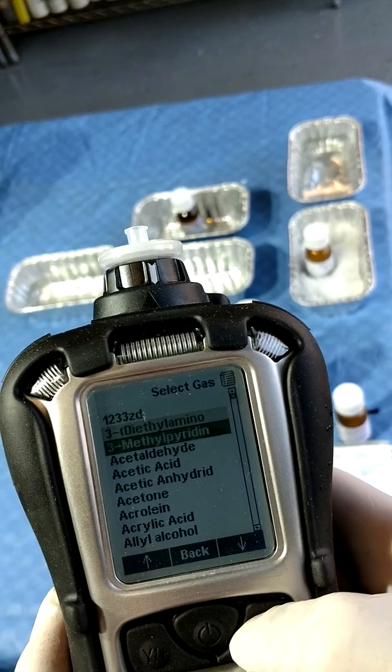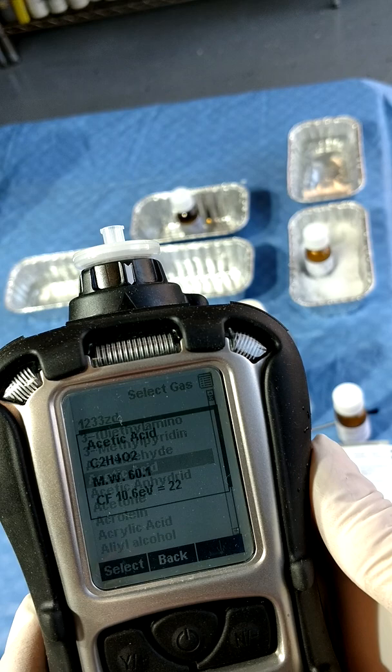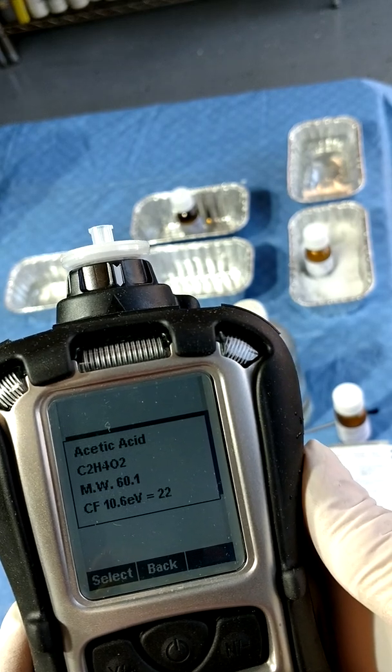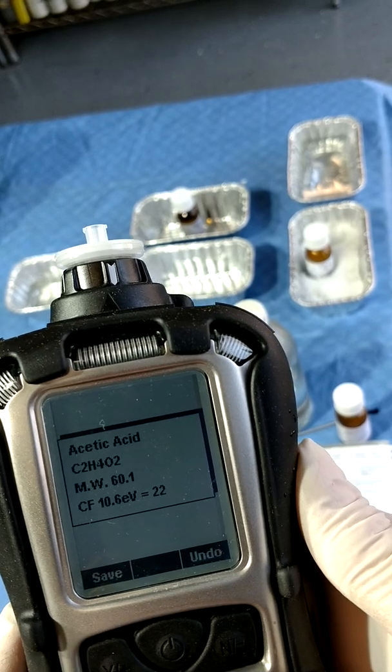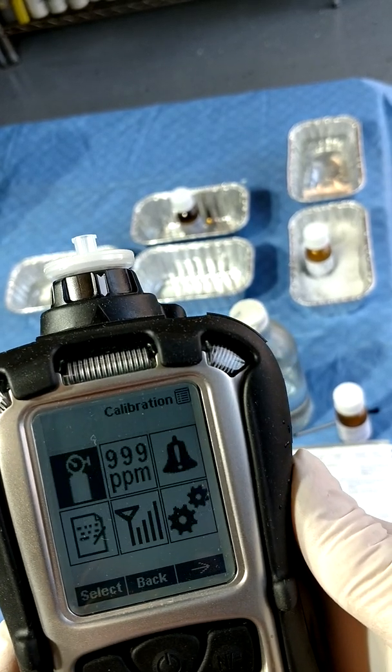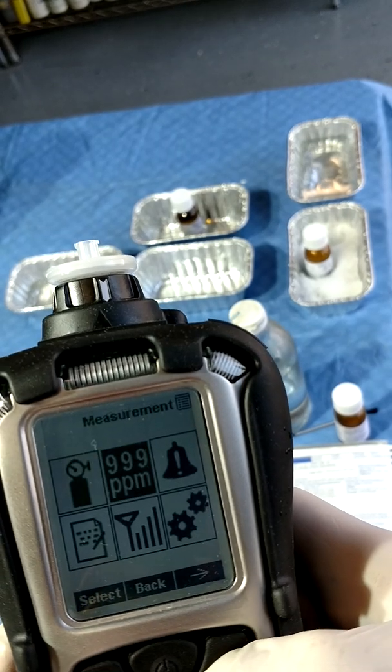Arrow down to acetic acid. Wait. You see the correction factor comes up for acetic acid at 22. Select. Save. Now we're going to go back to measurement again.